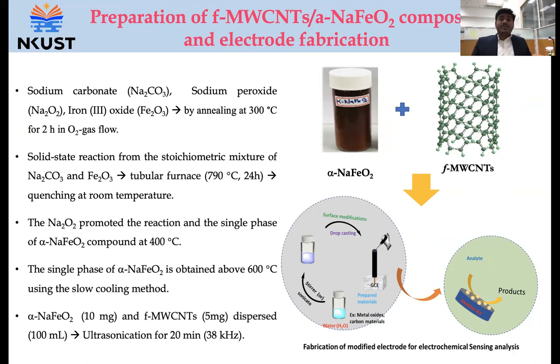After getting the sodium ferrite compound, we introduce the functionalized multi-wall carbon nanotube and combine it with sodium ferrite for composite formation using an ultrasonication approach at normal room temperature with 20 minutes of vibration. Finally, we get the composite of functionalized carbon nanotubes and alpha NaFeO2 composite material. Further, after getting this material, we modified the electrode surface.